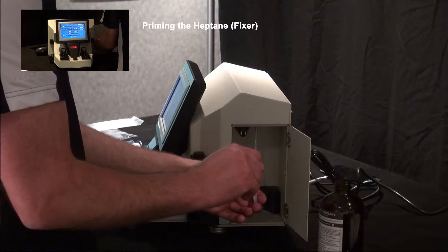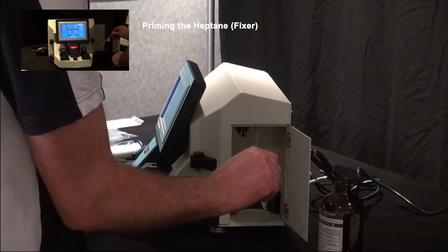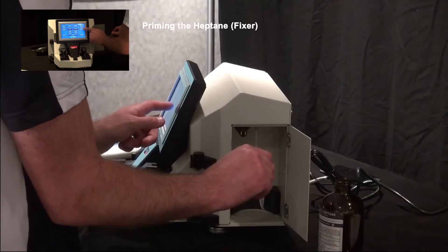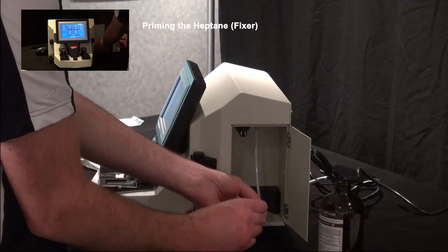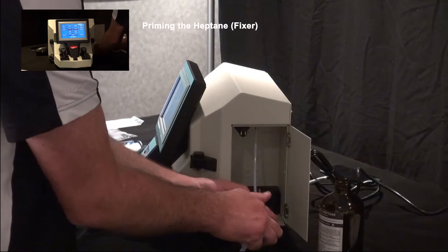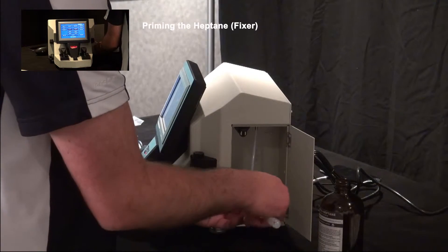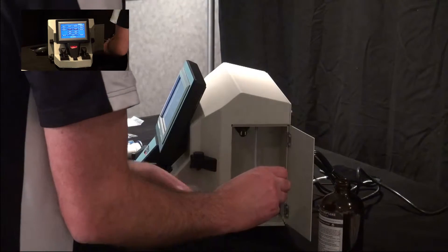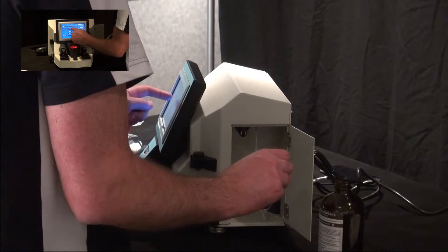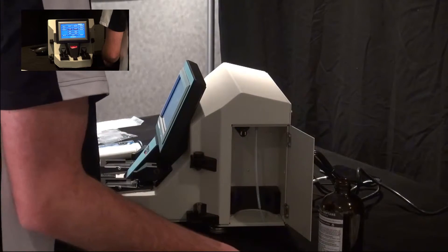Squeeze the bulb until the heptane comes out one of the front stations. Once you're starting to get some heptane at station two, turn fixture two off. Then pull the priming bulb off the line and plug it into the next one. Squeeze until it comes out the front. Once you have heptane coming out of station one, stop the fixture and pull the priming bulb off. Both lines are now complete.